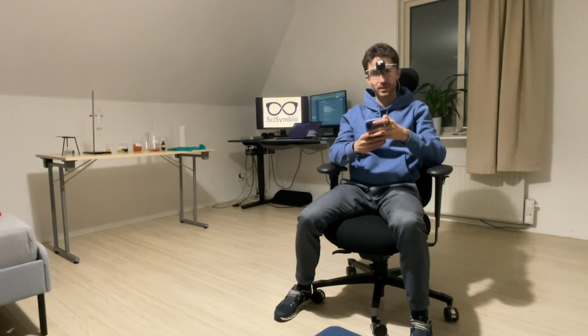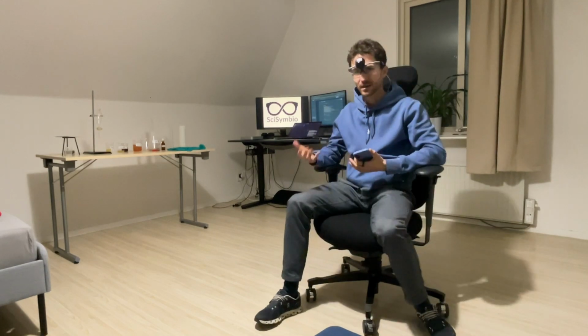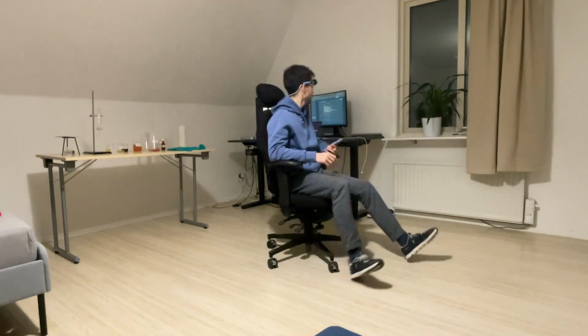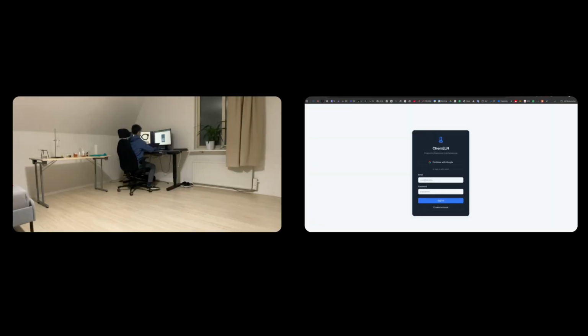But before I do that, I follow the normal workflow of an experiment, how everybody would do it in a natural way, which starts with the planning phase of the experiment. Here we developed our own dummy ELN system just for demonstration purposes.